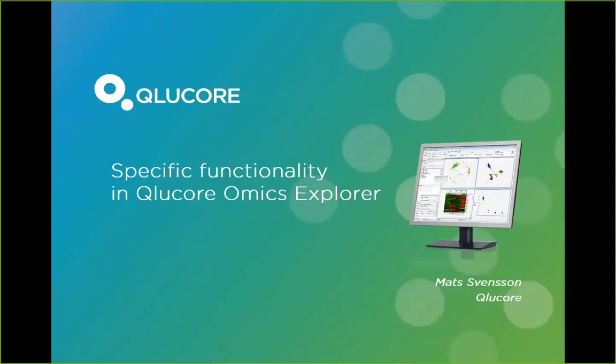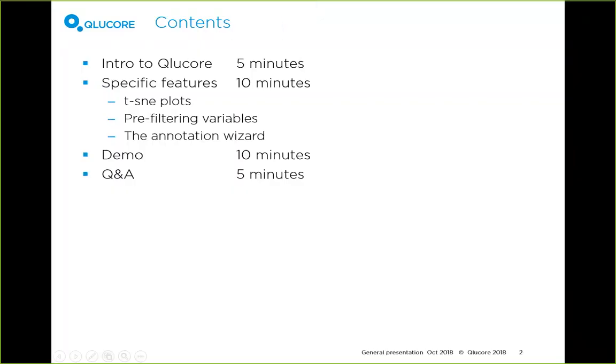Today we're going to talk about some specific new functionality in Omics Explorer. If we take a look at the agenda for today, it looks like this. I'm going to give a brief intro to Qlucore because some of you might be very new to the contact with our company. I'm going to tell you a few words about who we are and what we're doing. It's going to be very brief, though.